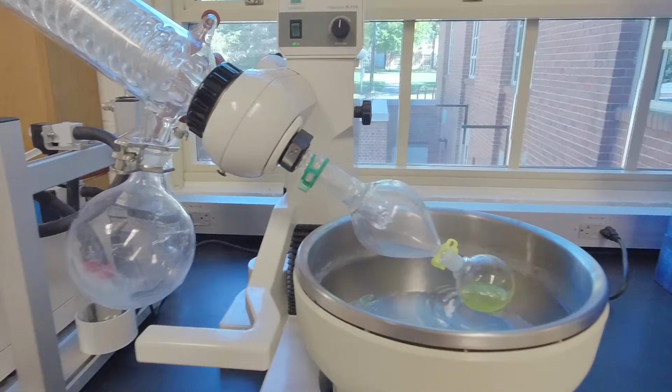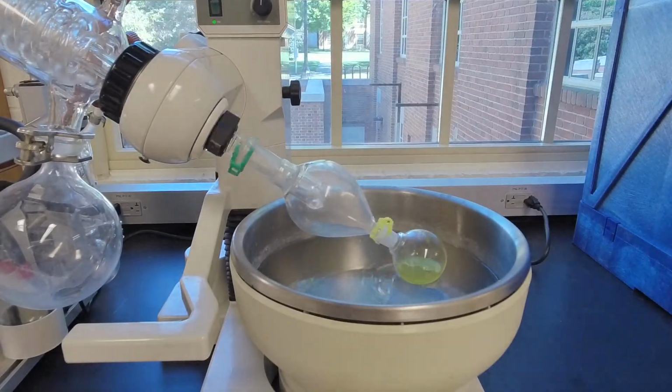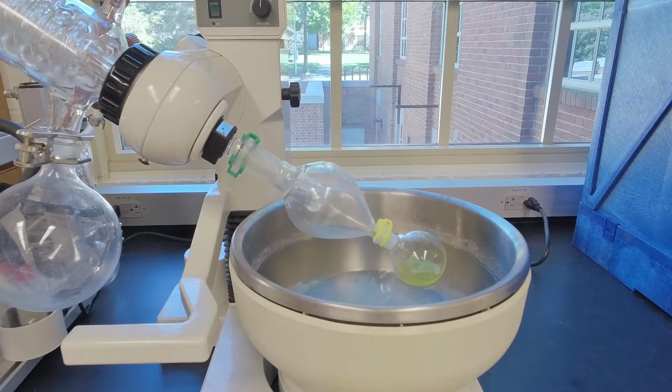I'm never going to win an Academy Award, am I? All right, so let's watch the flask now. Sorry, I keep not tightening the right thing. You guys could probably afford to fast forward at this point if you haven't already.